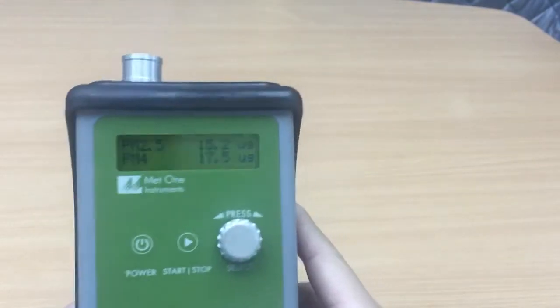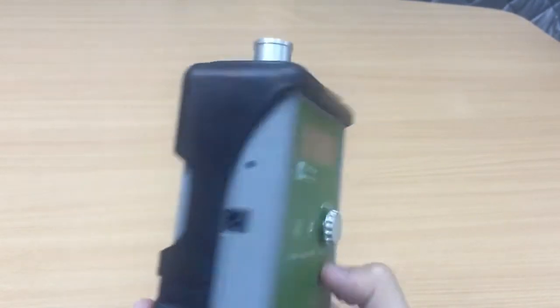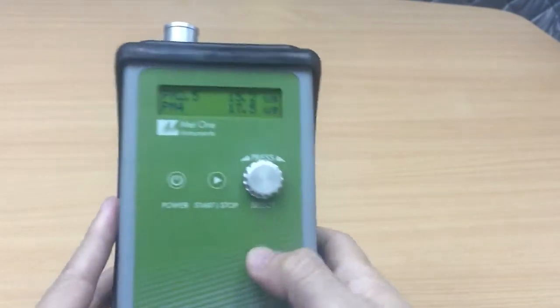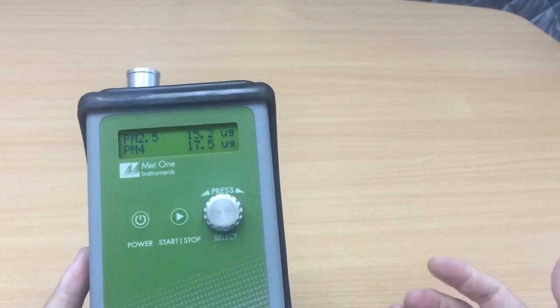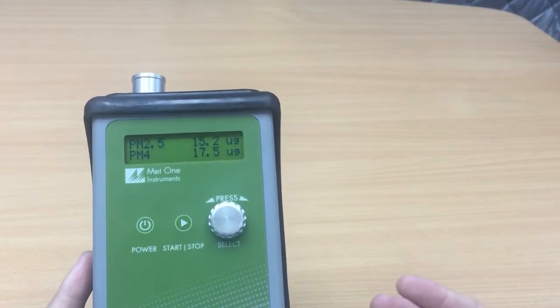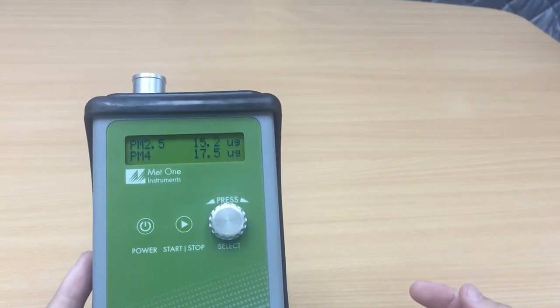What are the other functions? So in a nutshell, that's how we use the instrument. We charge it, we turn it on, we start the sampling and then one minute later we have an indication of how dusty or how clean a particular room is.